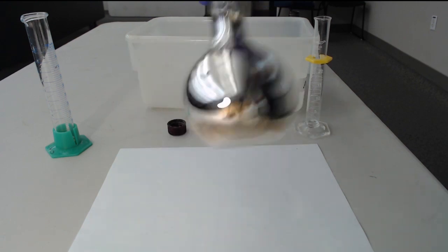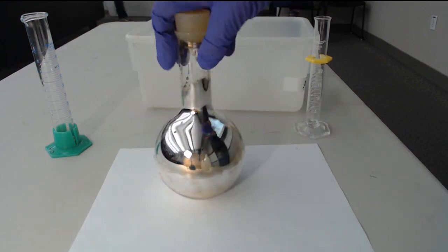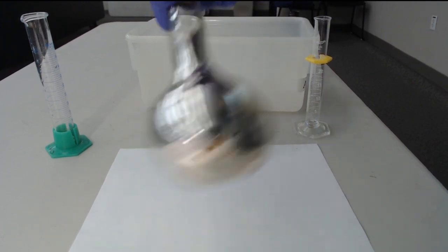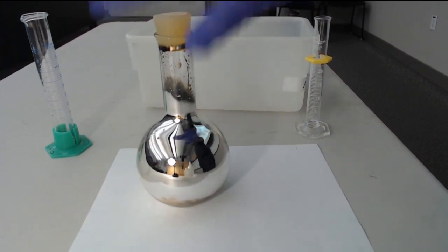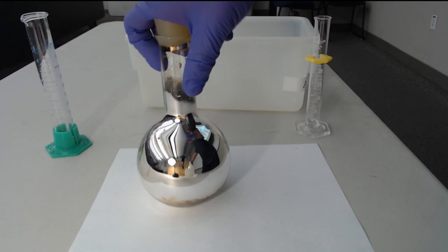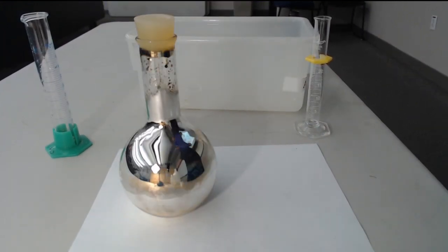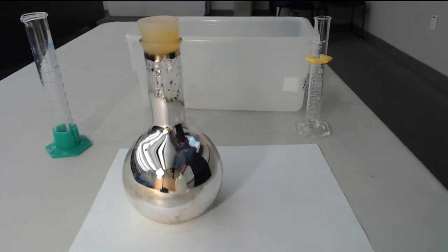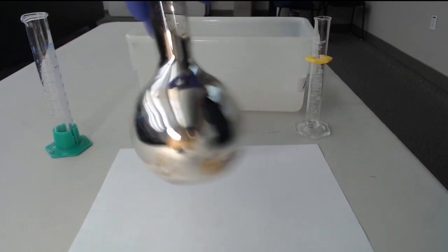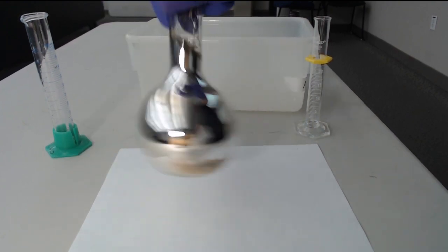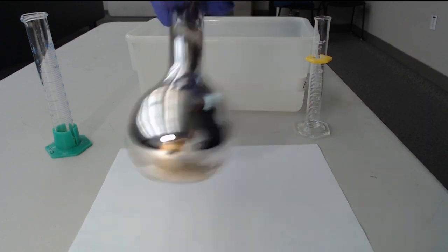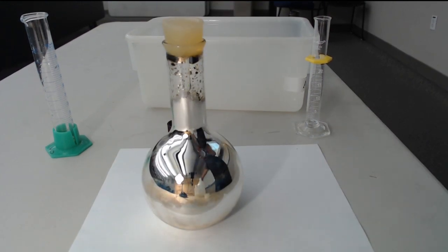So basically what we did here was the first thing I made is called the Tollens reagent. And the other name for it is ammoniacal silver nitrate. And it turns out that that's actually a pretty good solution we can use to test for the presence of sugar. And what happens is it does a redox reaction. Remember we talked a little bit about redox last time. Essentially what redox reactions are is when the charge on ions change. And the silver plus ion becomes silver metal in this reaction. So what's happening once again is silver is being reduced, meaning the sugar is oxidized.